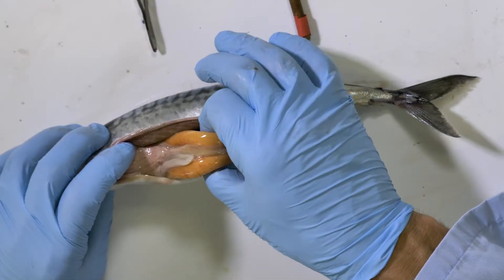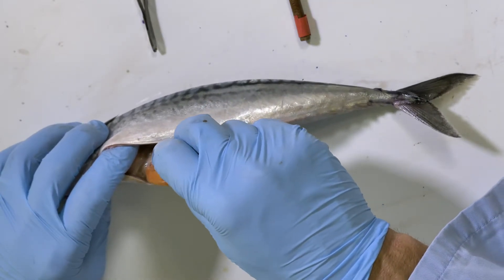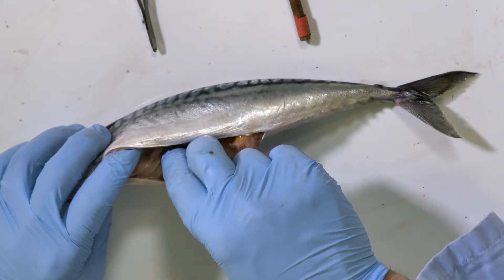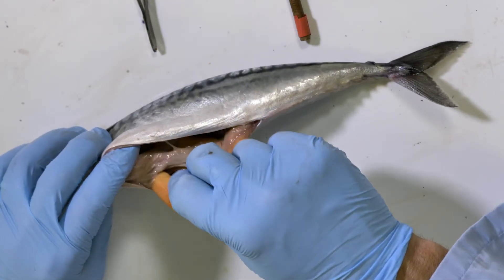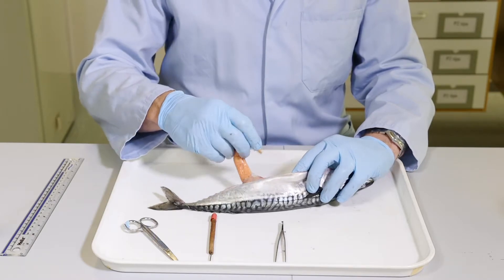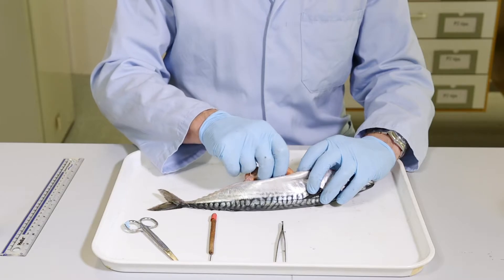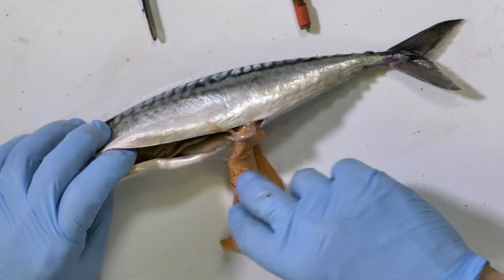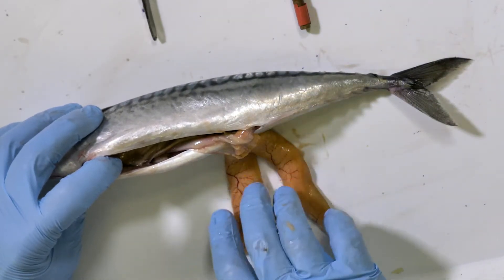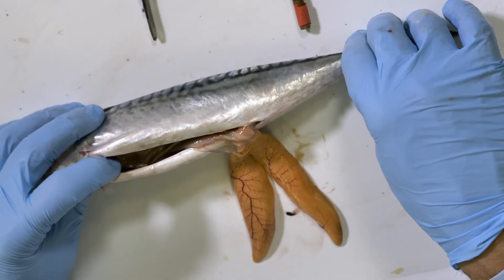Immediately it's possible to tell that this is a female fish because these very prominent orange structures — which if you feel them feel slightly granular — are the ovaries of the fish. Sometimes it's much more difficult to identify whether the gonads are ovaries or male gonads. At least 10% of the weight of this fish I would say is in the two ovaries that I've now laid out beside the body of the fish.